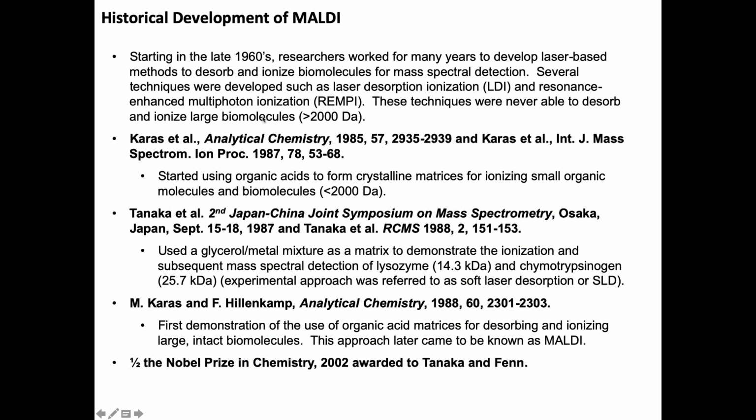The development of it actually started in the 60s, of course, where people were using laser desorption, trying to get things above 1,000, 2,000 molecular weight. And the real watershed moment was when Hillenkamp and Karas, who were really the two guys who were given credit for developing MALDI, started putting their analytes into organic matrices.